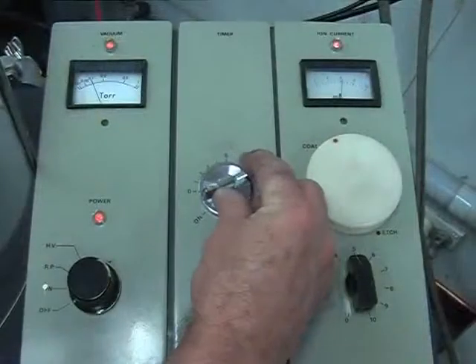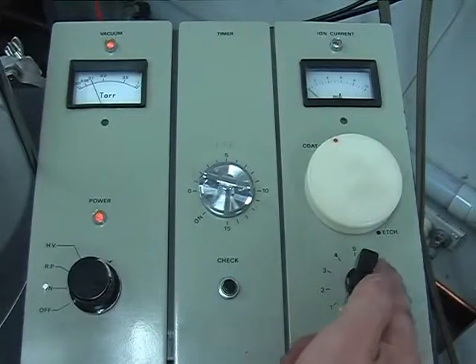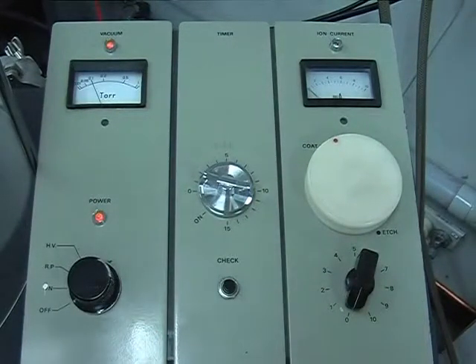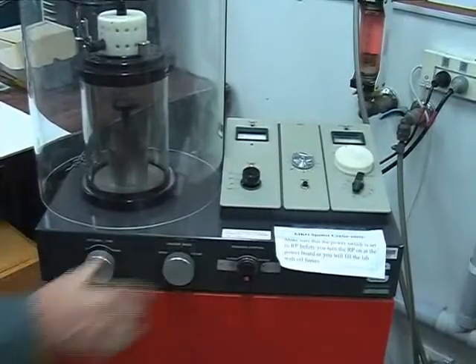Turn the ion current to 0, close the argon pressure control needle valve using gentle pressure, then close the vacuum valve on the front panel fully.